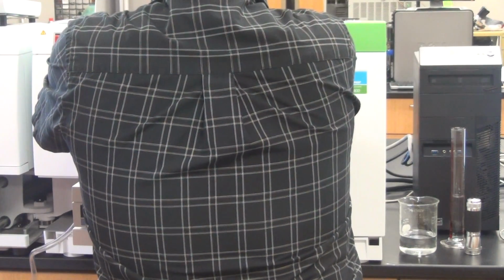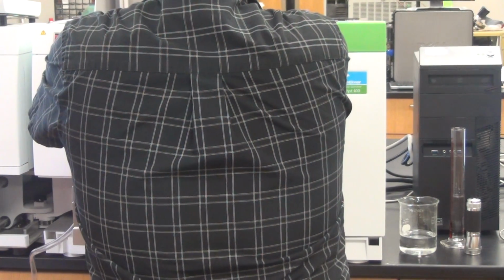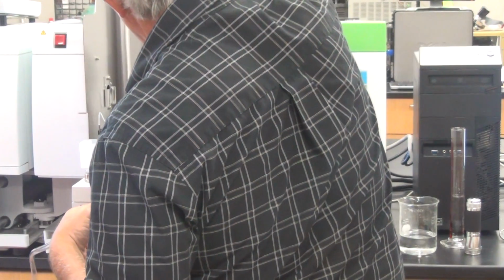It doesn't make a whole lot of difference till I get way out. Okay, what you're doing is finding your focal point. So I'm finding out where it's at. If I really wanted to look, and I had this out of the way, I would see I have a big beam, the focal point. And it's really going to be right about here somewhere.